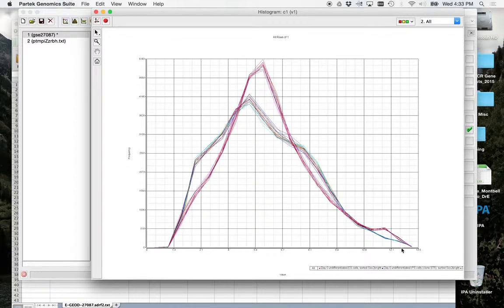So basically this scale, when I see numbers like 13, 11, 12, 8, 3, what they have done is they have normalized it using log 2. And that is something we do in bioinformatics all the time. Anybody know why you want to log 2 this stuff? Any ideas? No?